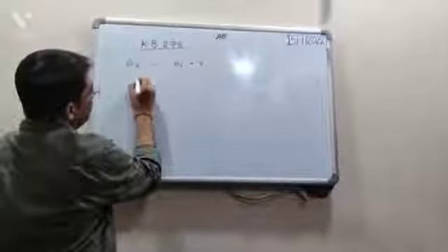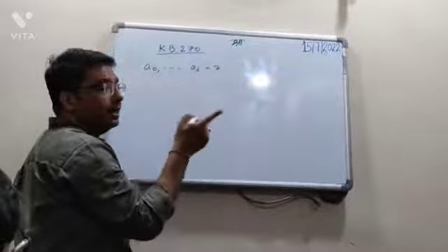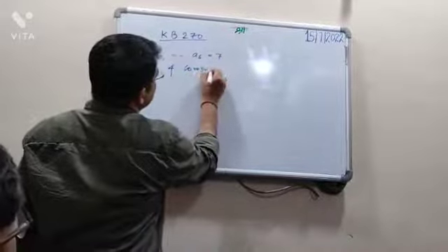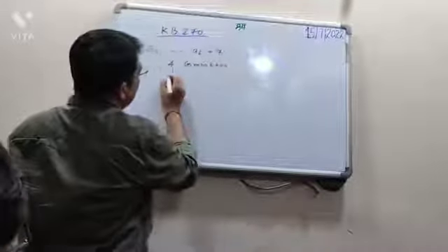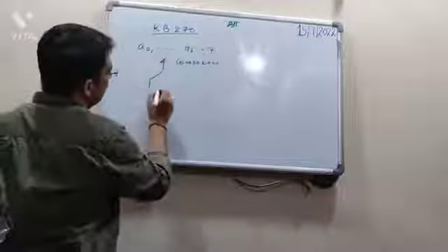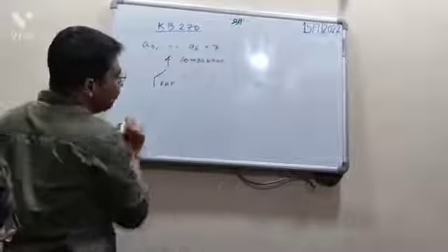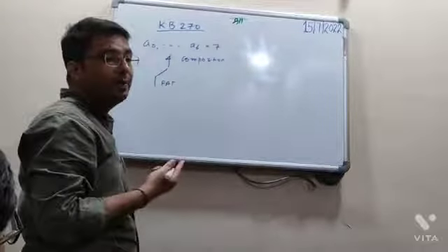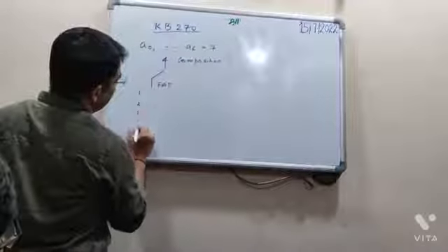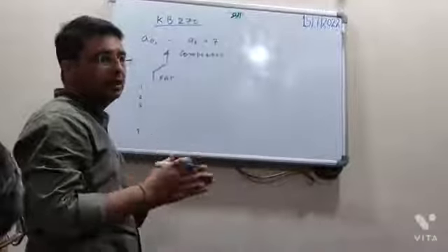Let's say, how many channels are there in KB-270? 50. But a single channel can have 4 compositions, right? Now, let us take one composition, and assume it is a fat or oil or whatever it is. In this composition, you require a minimum of how many samples to be tested? 9 samples are required to be tested, right? Then it can do a calibration on the machine.